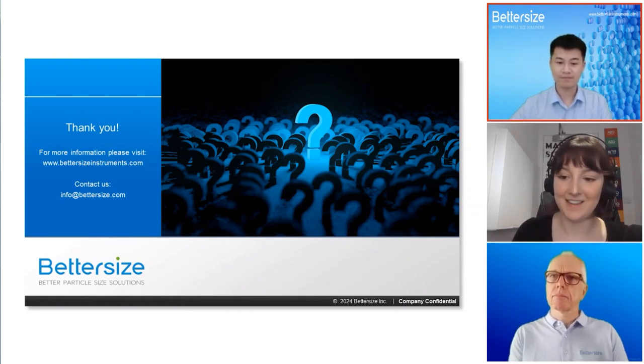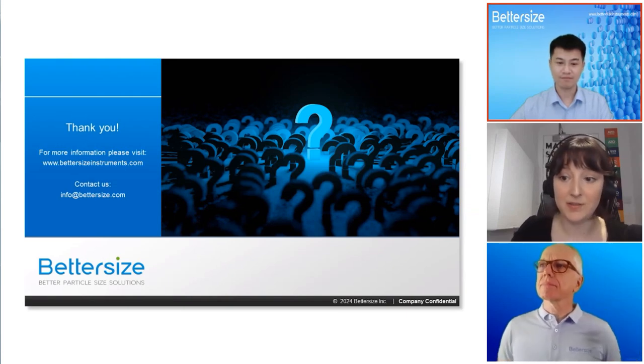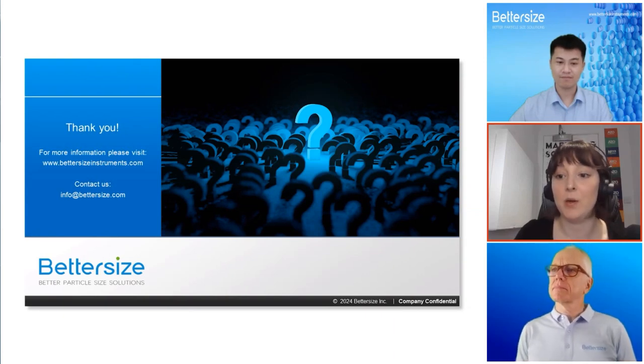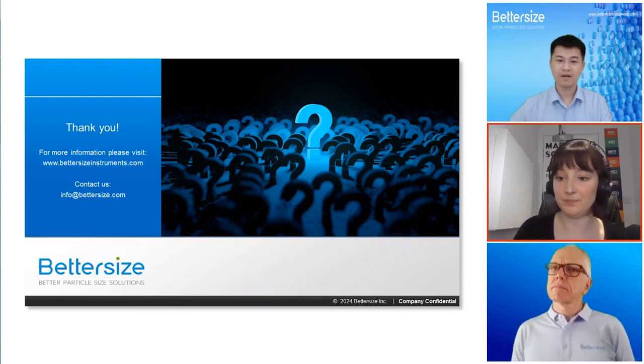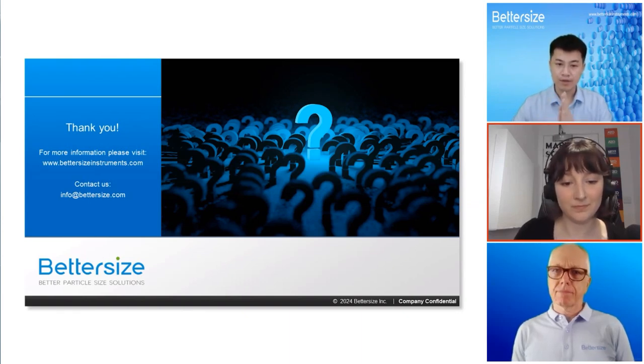That's fantastic, thank you. And staying with yourself, we've got someone else whose sample is dispersed in a high ionic strength medium. Would it be necessary to dilute the sample before measuring its zeta potential? That's a good question.